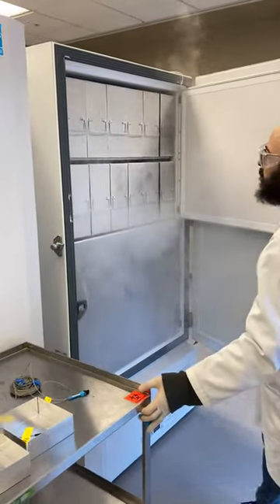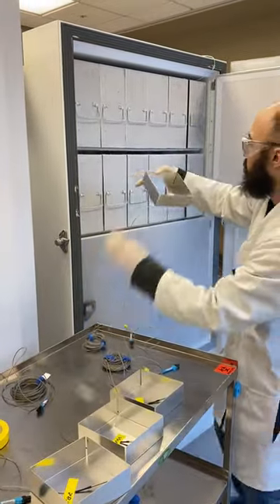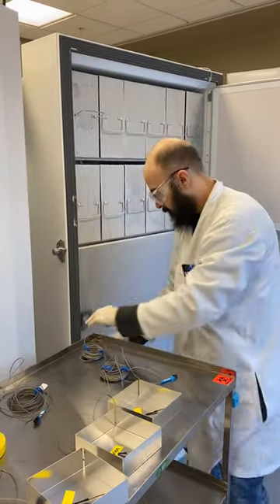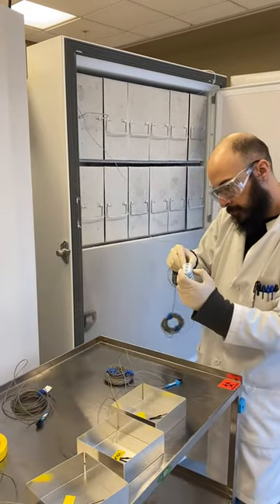Placement of probes must occur in a timely fashion to avoid unnecessary increases in freezer temperature. Activity in the freezer must temporarily cease if the temperature alarm is triggered. Once probes are placed, the freezer should remain unopened for the duration of temperature mapping.